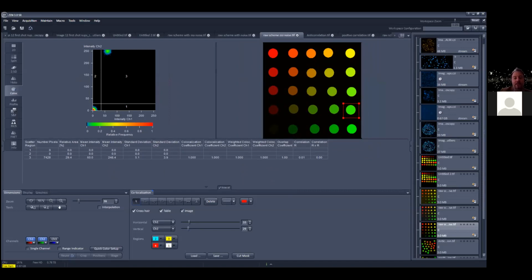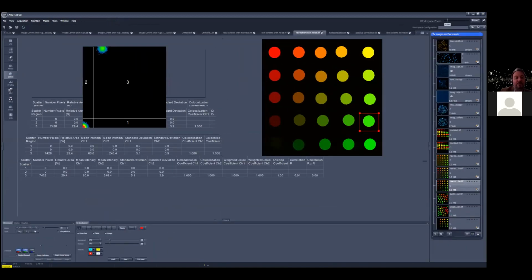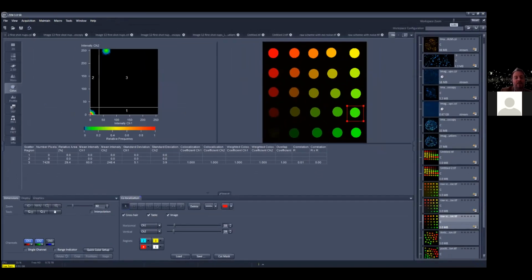I can increase the size of graphics and everything, but it will not increase the font size of the table. So buttons become larger and smaller, but not the table. So I'll leave it at some size like here. And this table is organized as follows.